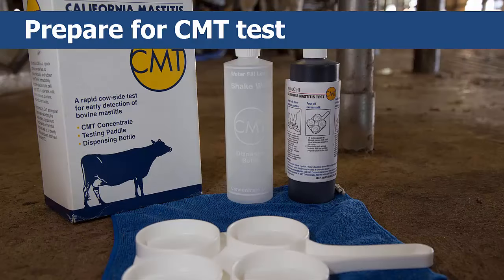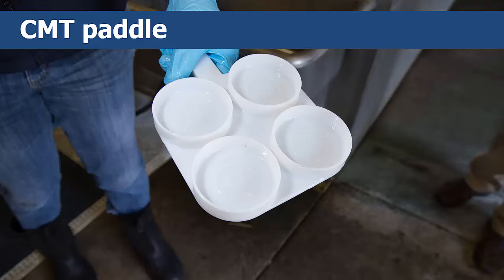Begin by having a CMT testing kit on hand, which you can get from any farm supply store. The CMT testing kit consists of a CMT paddle and a bottle of CMT solution. You should also grab a pair or two of latex gloves. The CMT paddle is a lightweight plastic paddle with four shallow cups marked A, B, C, and D to help identify the individual quarter from which the milk was obtained.